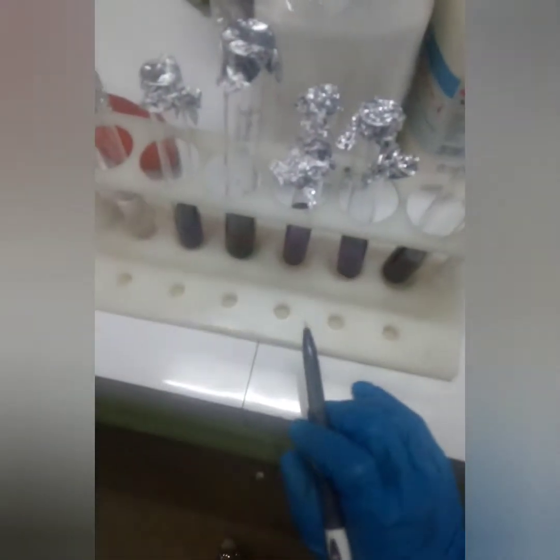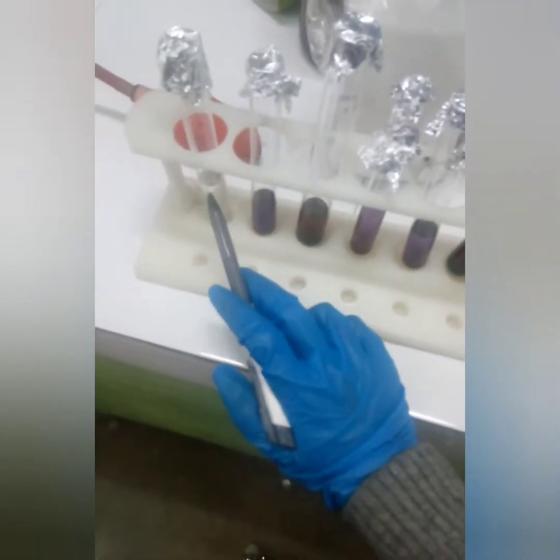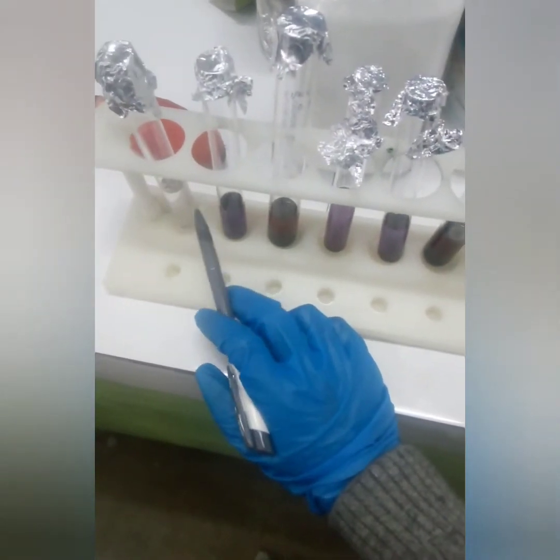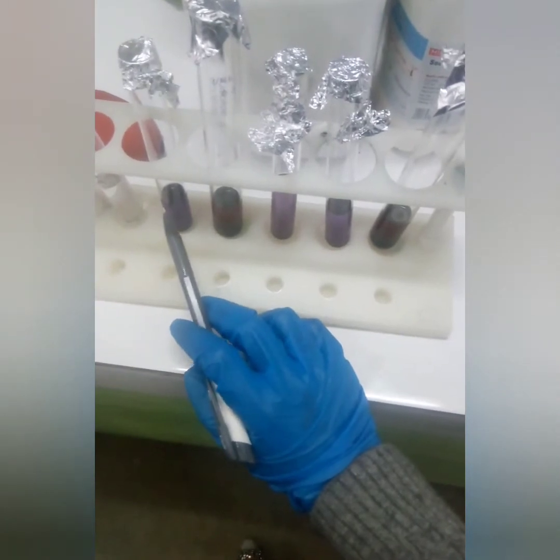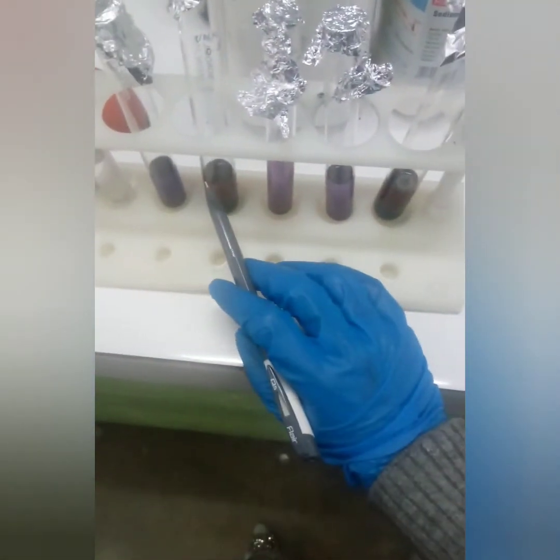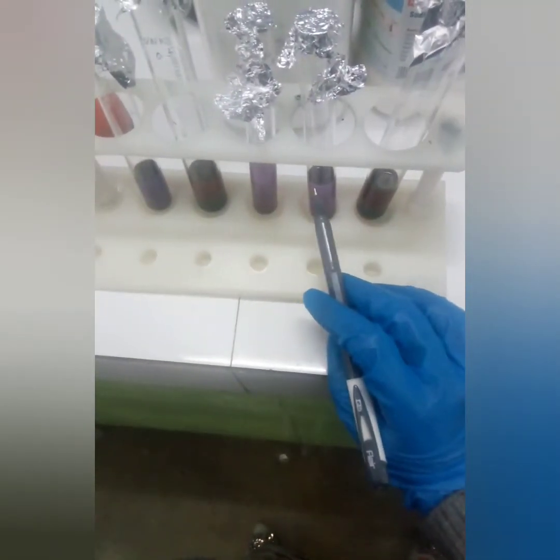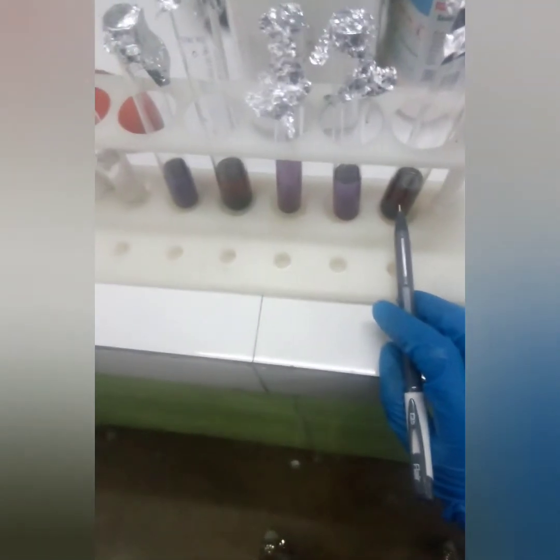Now you will pipette out different concentrations of amino acid. Since this is a blank, here we will not add any amino acid. Then in the first one, we will take 0.1 ml. Then we'll take 0.2, 0.4, 0.6, 0.8 ml, and 1 ml of amino acid.